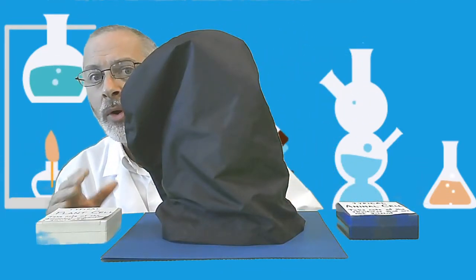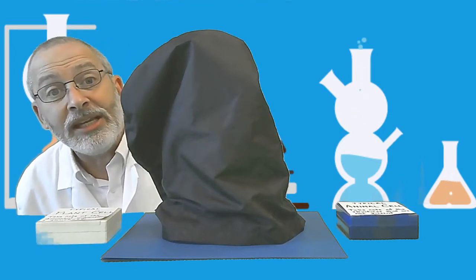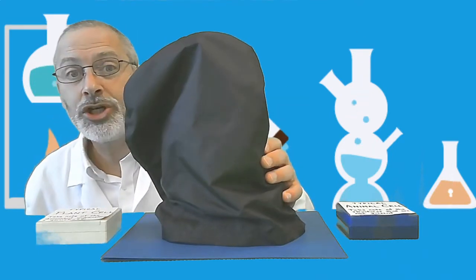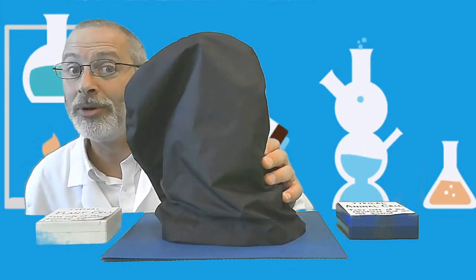All right, we're going to go through the various steps of this particular lab activity. The first thing that you need to do is acquire a microscope. Raise your hand if you remember the proper way of transporting a microscope.